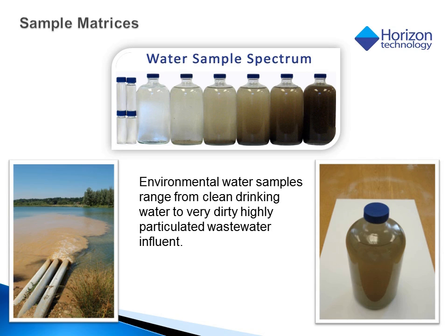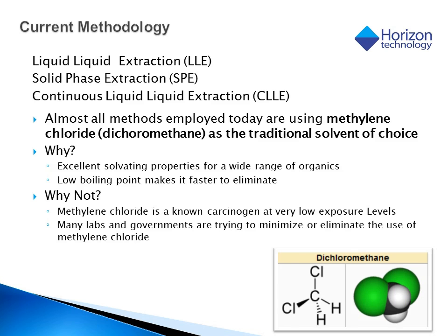As all of you are aware, water samples range from extremely clean samples all the way to heavily particulated, dirty samples, depending on their source. Today's environmental testing laboratories are faced with the entire spectrum of samples from clean to dirty, and trying to use standardized methodologies to treat incoming samples the same way. Current methodology today includes liquid-liquid extraction, continuous liquid-liquid extraction, and solid phase extraction.